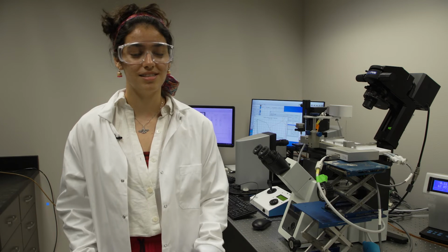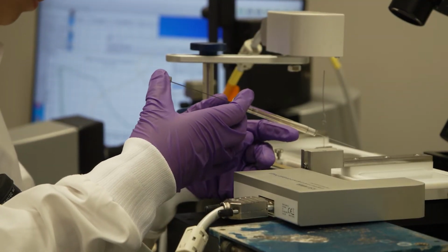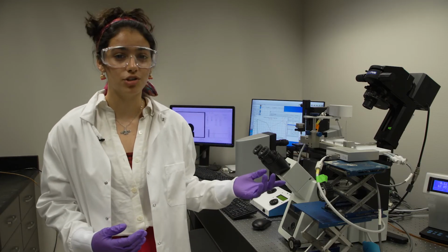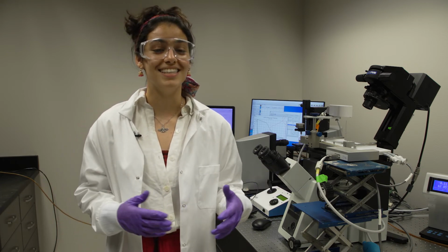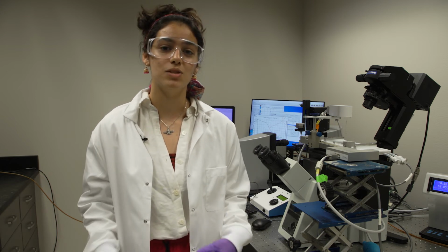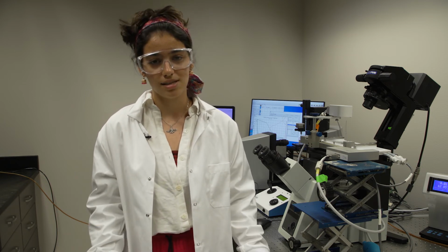My research focuses on studying a system of similarly charged species, specifically SDS surfactant molecules and silica nanoparticles. We're mainly trying to see if SDS will adsorb onto the surface of these nanoparticles. It's a debated topic because they're both similarly charged. We use the Langmuir trough to do this because it can give us information about the surface tension of the system. Applications include improving CO2 sequestration methods and wastewater treatment, because when the SDS adsorbs onto the particle surface, there's increased interparticle repulsion, which stabilizes the system.